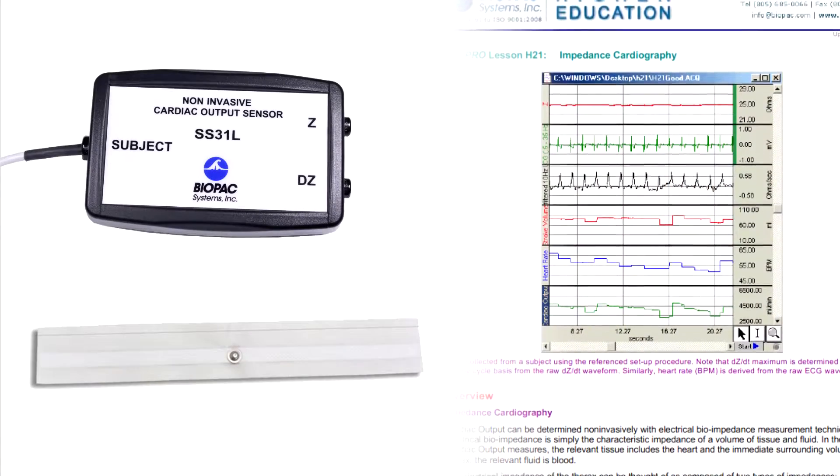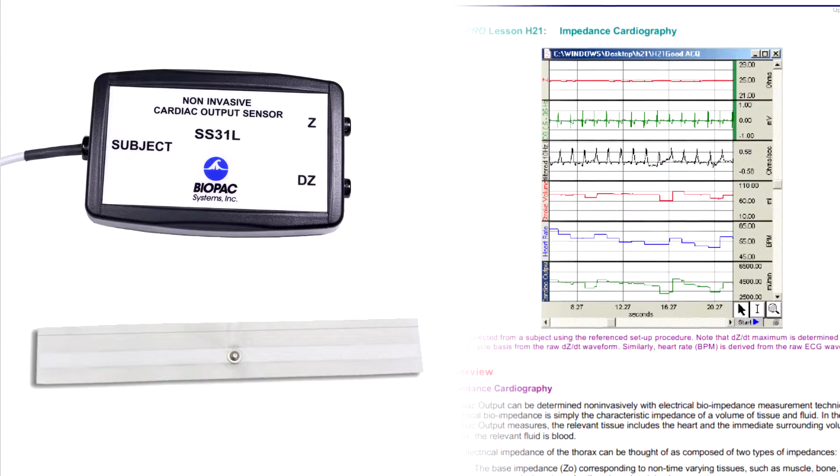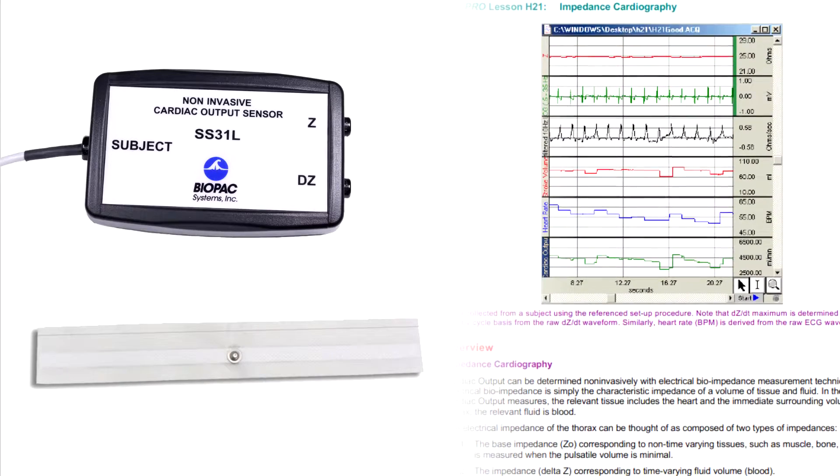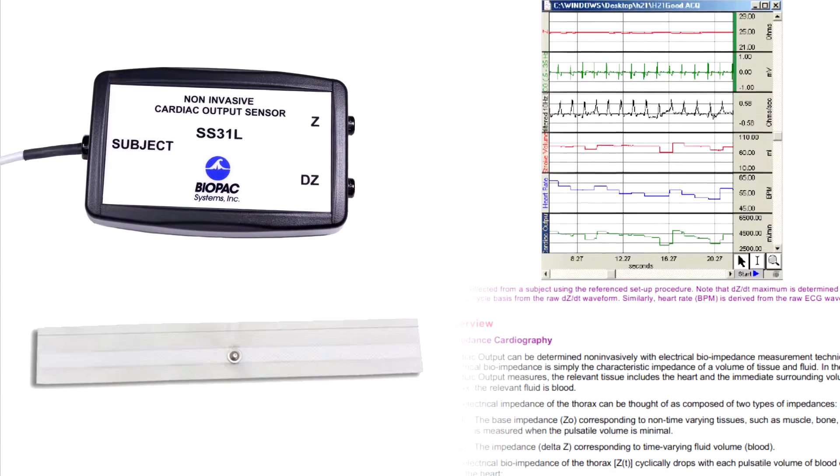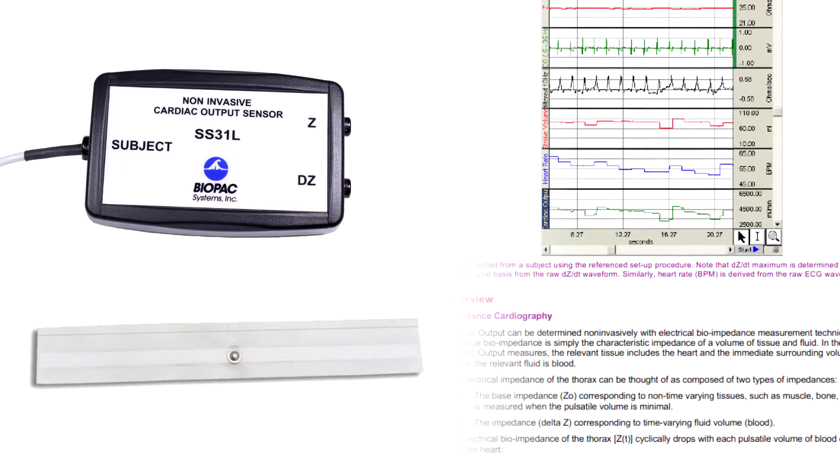The optional transducer accessory pack can be added to expand your system with hardware and lessons. This TA pack includes cardiac output sensor with bioimpedance strip electrodes.